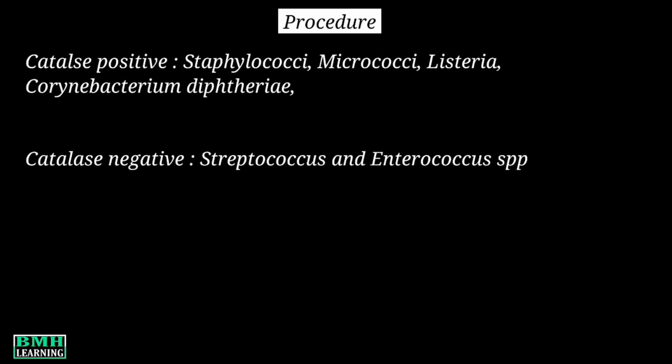These are some of the examples of both catalase and non-catalase producing bacteria. Now there are many uses of catalase test.